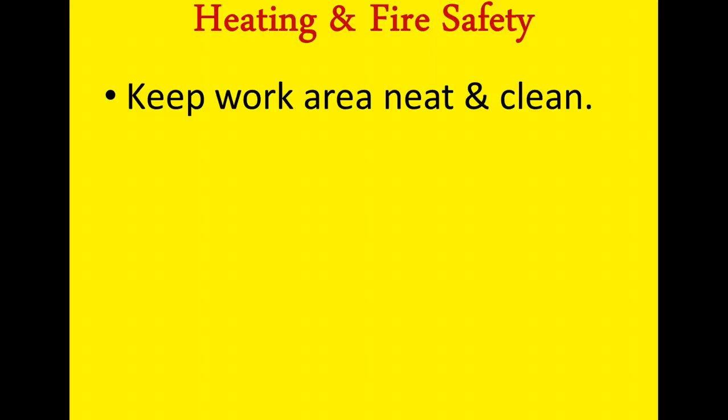Our next section is heating and fire safety. First of all, it's important to keep your work area neat and clean. If it's messy or there's a lot of stuff and junk around, it's easy to knock things over, which can catch on fire if we're heating anything up. So it's always important to have a work area that's neat and clean.